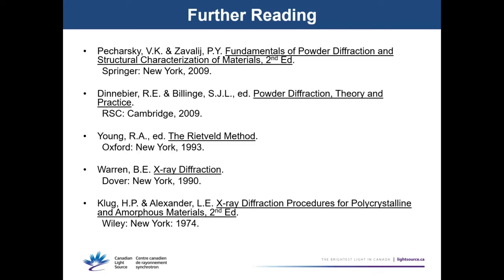Adam: All right, so my question is, some of these really problematic samples, do you tackle that with sort of pre-describing the orientation, or do you try to work that out? I'm thinking about the clays. Often we would try to make the clays purposefully lie flat. Does that go against what you want to do for your powder diffraction? Well, it depends. If you want to use a full pattern description of them, ideally you'd really like to get them randomly oriented. That's one nice advantage of the 2D detector.